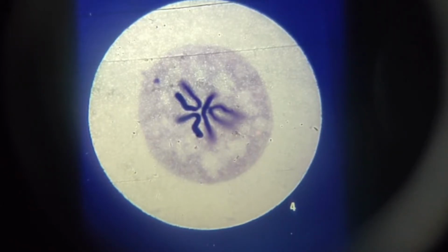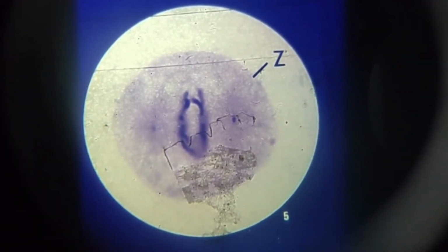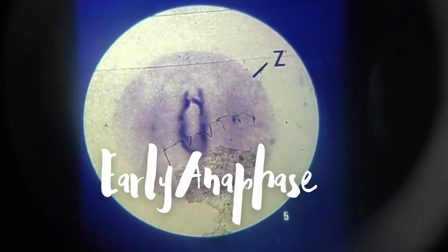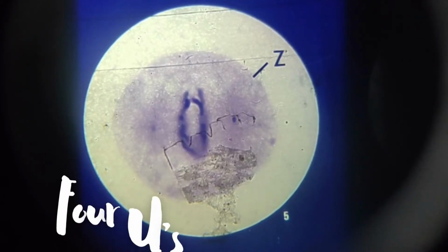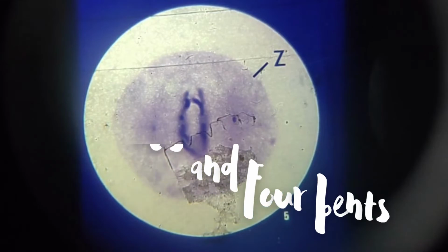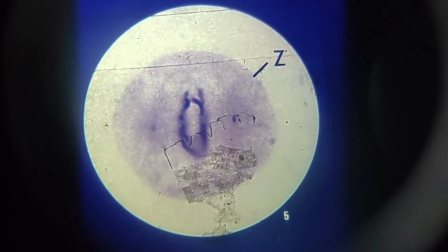Now let's go to slide 5. Slide 5 shows you the early anaphase. Each chromosome has completed duplication. There are now 4 U's and 4 bents. In these 8 chromosomes, there is enough hereditary material for 2 cells.